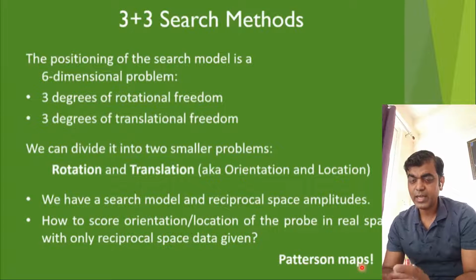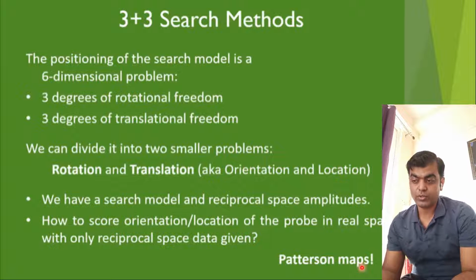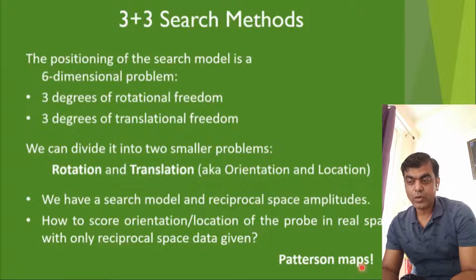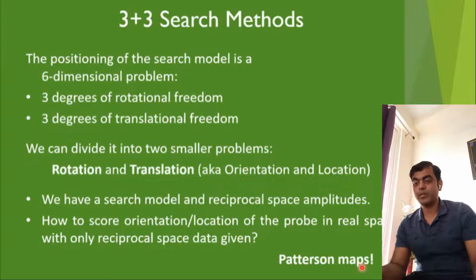So it's not that the unit cell structure alone is going to help, because if you try to build it, it will give a linear protein structure, and that is of no good use to us. We have to find the exact structure, right? So we have to always think of the reciprocal space, where the rotation and angles are very, very important.